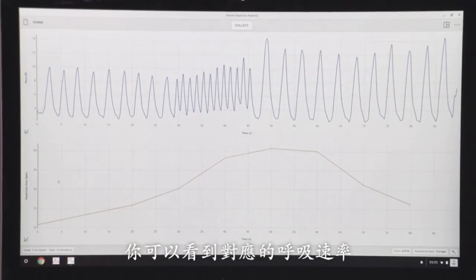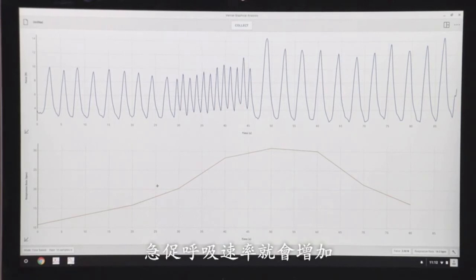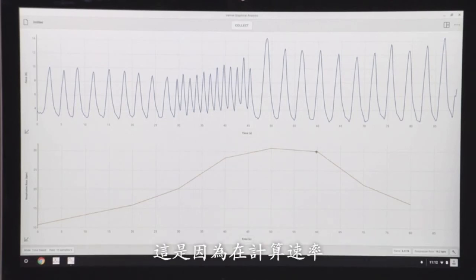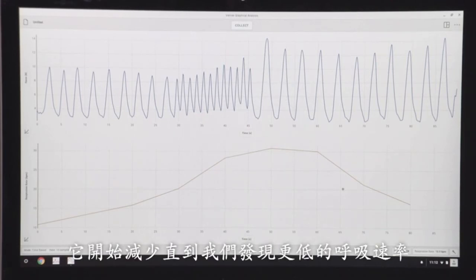You can see that the respiration rate corresponds to that. I'm breathing normally here, then I begin to increase my respiration rate — breathing faster — and it increases. Then it does take a little bit of time to respond when I begin to slow my breaths, but that's because we're calculating a rate. After three breaths or so, it begins to decrease until it finds the new respiration rate, which is much lower.